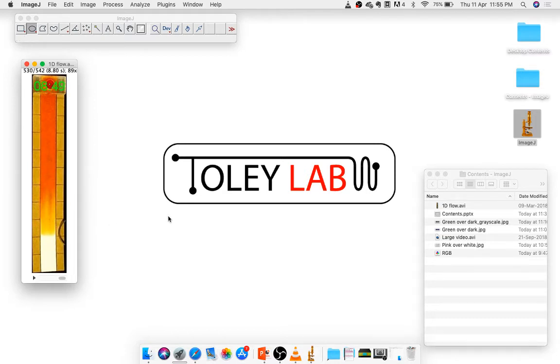By the way, the backslash key on your keyboard in ImageJ gets the movie rolling. That is how I got it. You can always move this scroll bar, but the backslash key has started it now, and backslash again halts or pauses it. I go back. Now in this particular case, the device was so made that there are 1 centimeter gradations. So this is one distance between this and this, and this and this is 1 centimeter, and this was done for ease of analysis. In many cases you will not have that gradation.